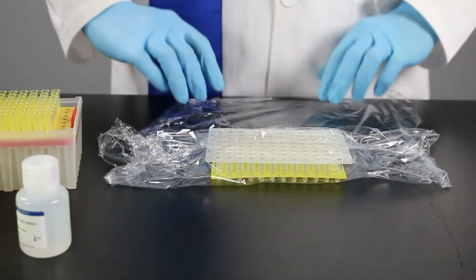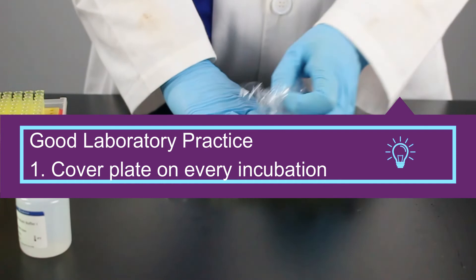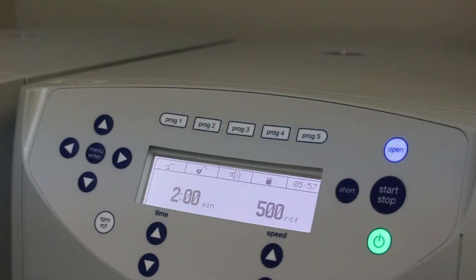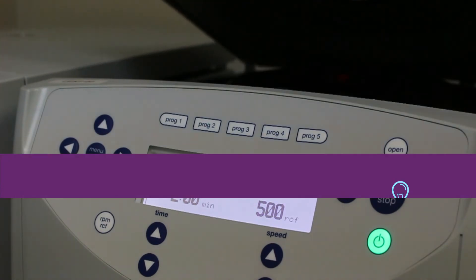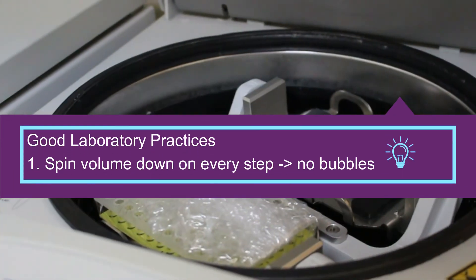Incubations last for hours, so definitely keep them covered. Our lab does a quick spin on every step to make sure all the liquid volume is down in the well and there are no remaining bubbles left. This will help with your standard deviations. A two-second spin will do, just turn it on and off.